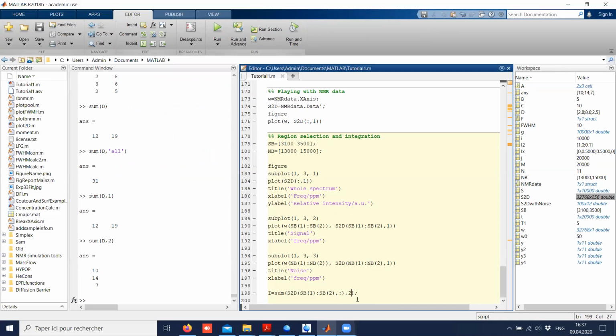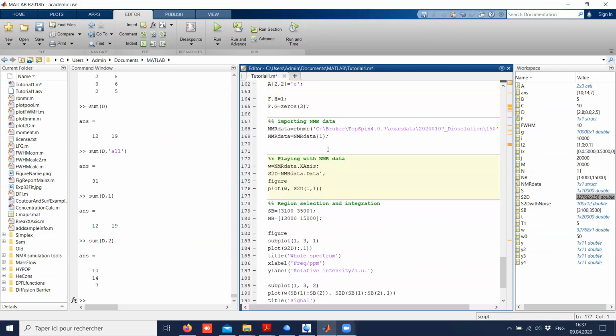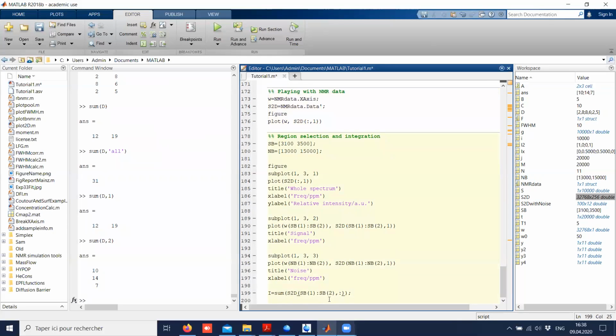So in this case, in fact, if I don't even write it, this is one of the reasons why earlier I told you that I always take the transpose. It makes more sense because when you have your data as columns and not as rows, when you do the sum, it's more natural to Matlab to sum in this way. So now I can make a figure with this.